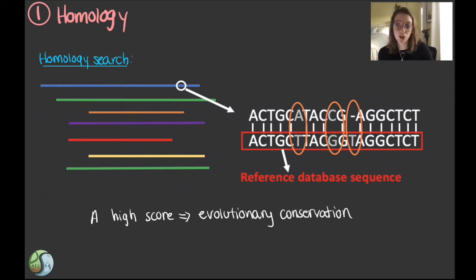And in our case, we're searching for sequences in our FASTA file that show alignment with a gene sequence known to code for an antibiotic resistance protein, antimicrobial resistance, or ARG sequences. In the case of PARE-Seq, the ARG database we will use was created for this activity to include sequences of the 5 resistance genes or gene families we discussed in video 4, Spotlight on Antibiotic Resistance Genes of Clinical Significance. When we see that the alignment tool in Galaxy has identified a specific sequence, then we can infer that this sequence is an ARG because of its close sequence similarity or alignment to a known ARG.